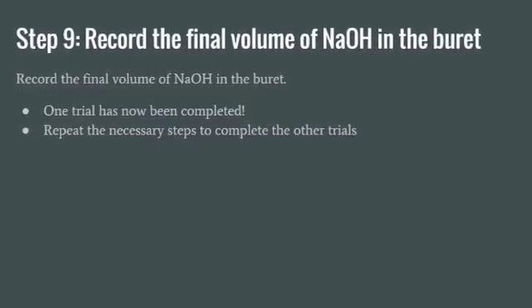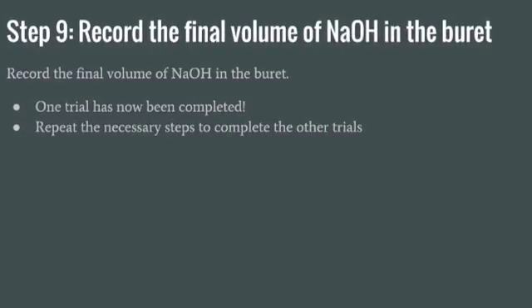For the next step, step 9, you're going to want to record the final volume of the NaOH in the burette. Once this is done, you have your first trial completed. Then you're going to want to repeat the steps that are necessary for the other trials.